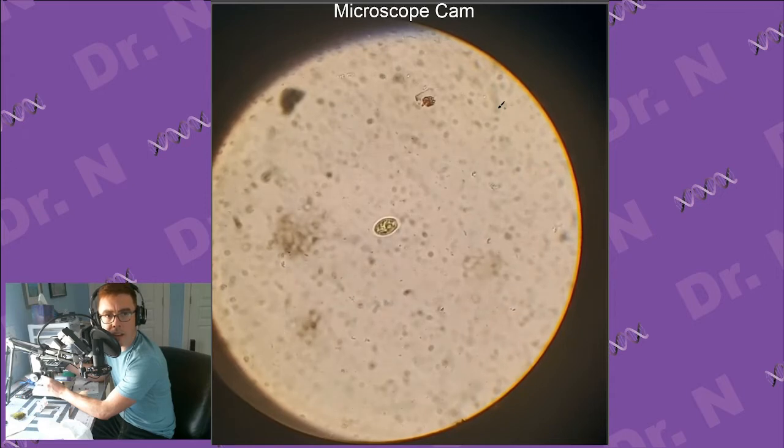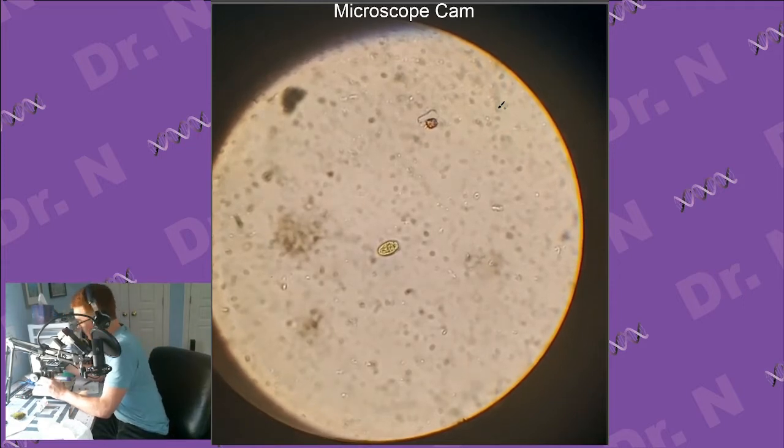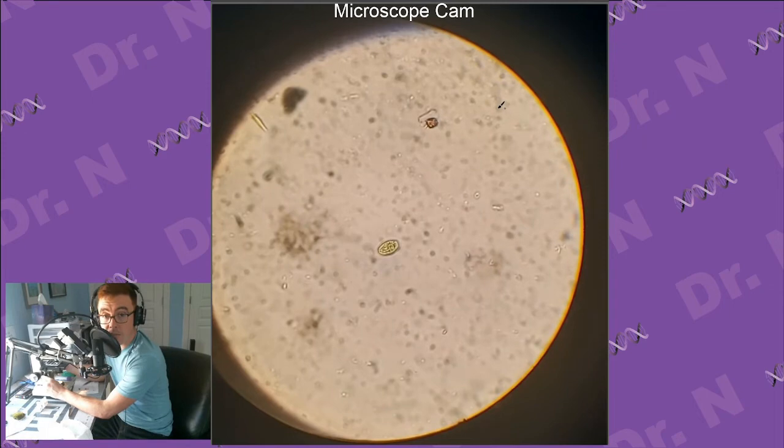This guy, also very interesting. Very green. Doesn't look like he's moving. I'm going to look under the eyepiece really quick. So unfortunately for you all, I have more clarity on the eyepiece. I just can't get the same with this camera. He looks nice and clear. I can see some structures inside of him, but I can't tell what's what. It's also not moving. It could really just be a single piece of the moss that I washed off, or he could actually be his own little thing. Let's move on and see.